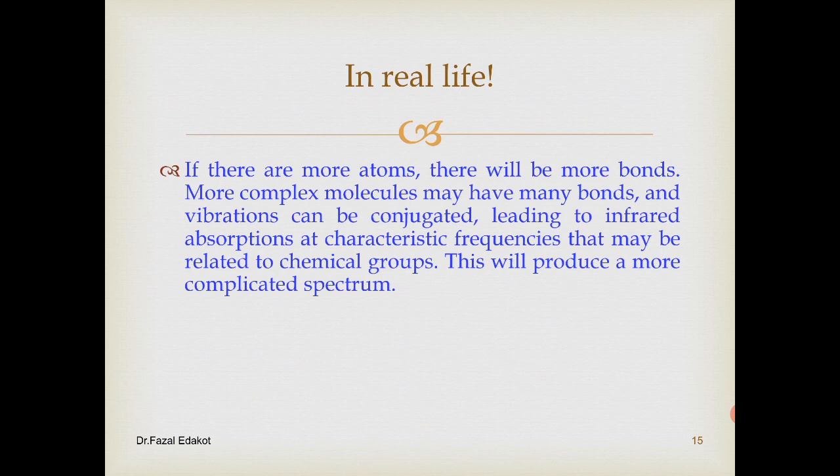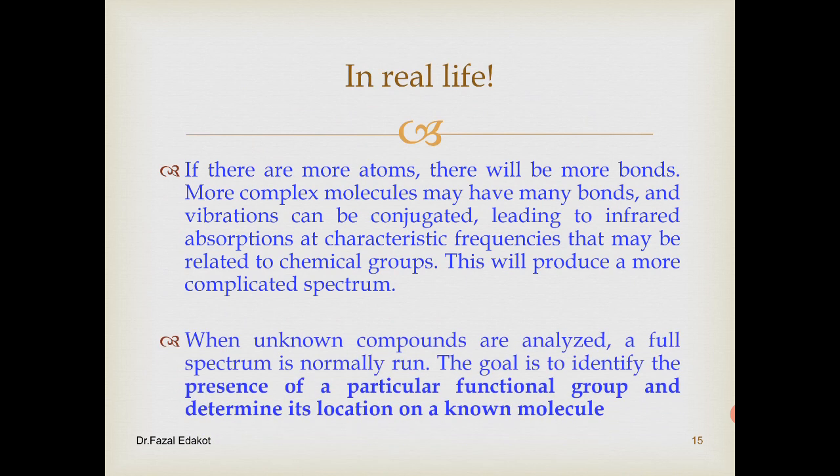The more complex molecules may have many bonds, and vibrations can be coupled, leading to infrared absorption at characteristic frequencies that may be related to the chemical groups. This will produce a more complicated spectrum. So when unknown compounds are analyzed, a full spectrum is normally run. The goal is to identify the presence of a particular functional group and determine its location in a molecule.